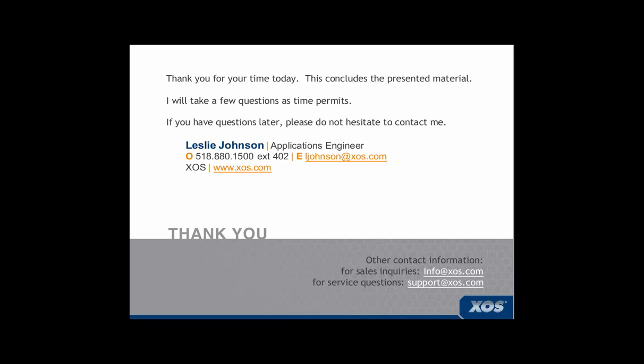And I have a question here where it asks, is it better to use one 600-second analysis time or two 300-second analysis times? And of course, you're going to want to make sure you're following whatever method you're using. If you're doing 2622, you're going to be required to do duplicate measurements for your gasoline samples. So in this case, I would say the two 300-second measurements. But in a practical manner, the two 300-second measurements or the one 600-second analysis are fairly equivalent.